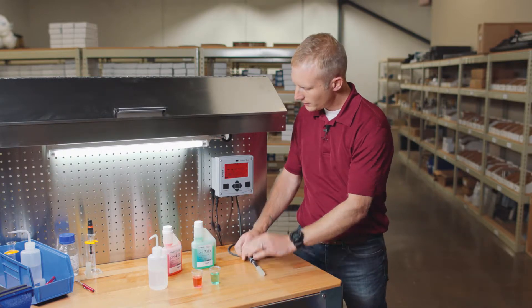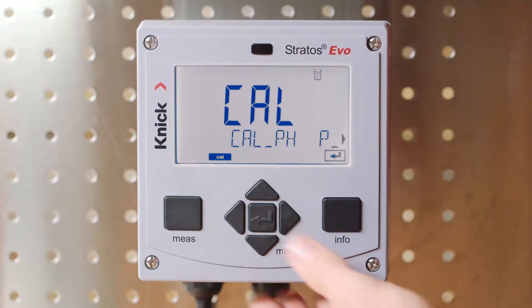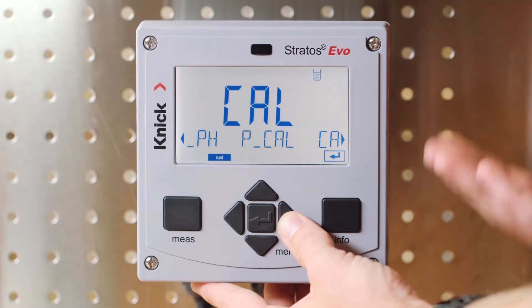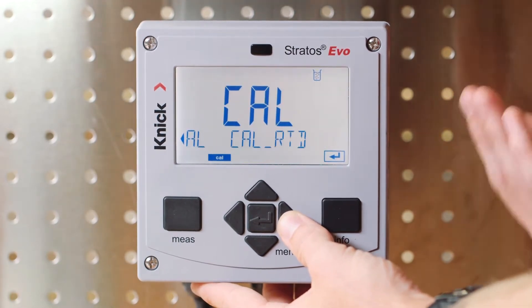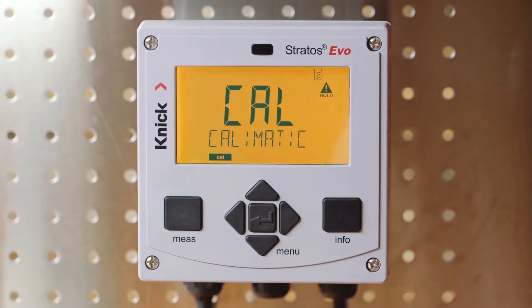Let's begin by connecting our MemoSense pH sensor, pressing the menu button, and then toggling right to the calibration screen. Here you will see our three options for calibrating the sensor: Cal pH, pcal or process calibration, and finally Cal RTD or calibration of the internal temperature detector. We will select Cal pH to begin the process.